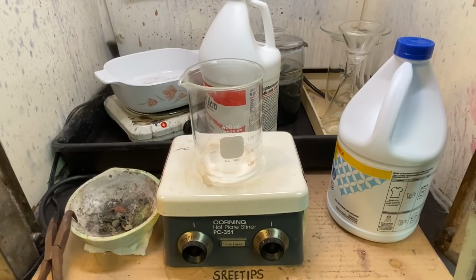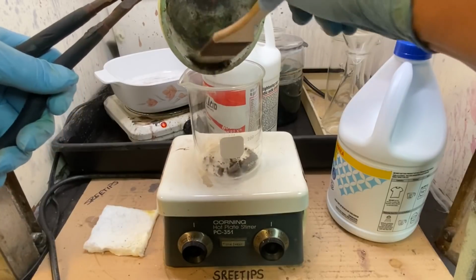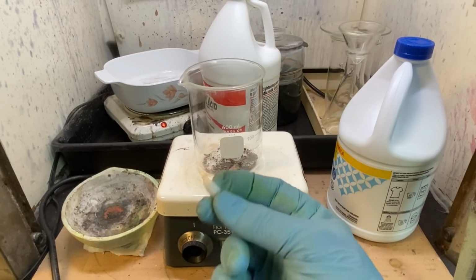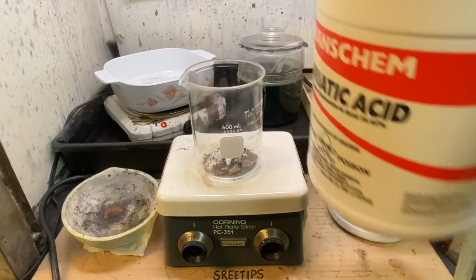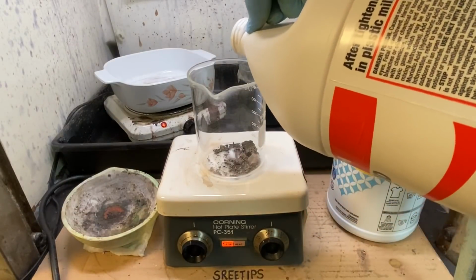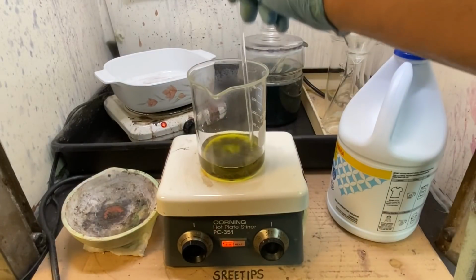All right, I'm going to transfer our incinerated material into this 600 ml beaker. I'm going to add a stir bar here. And we're going to put some hydrochloric acid in here on the material. About 100 milliliters or so. All right, I'm going to try to break up these chunks a little bit.